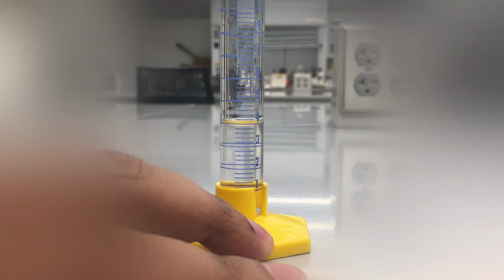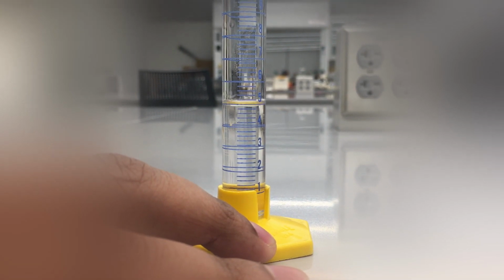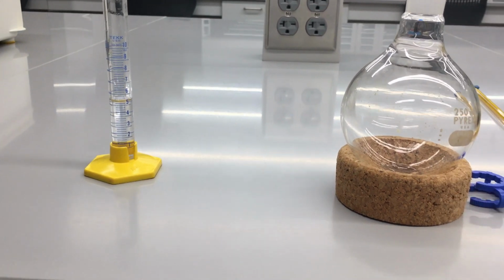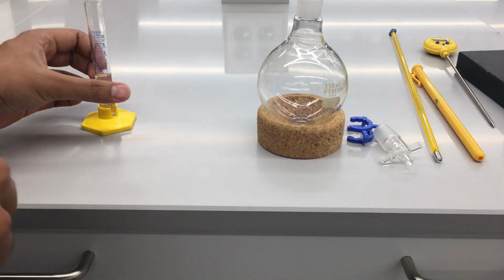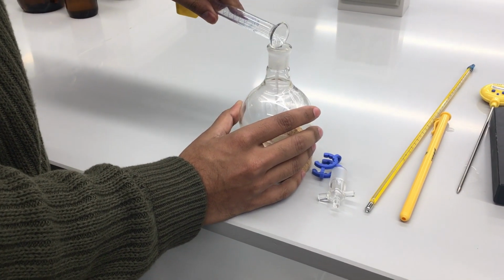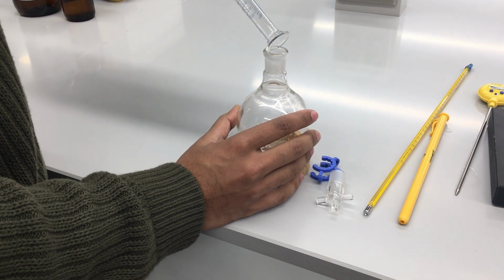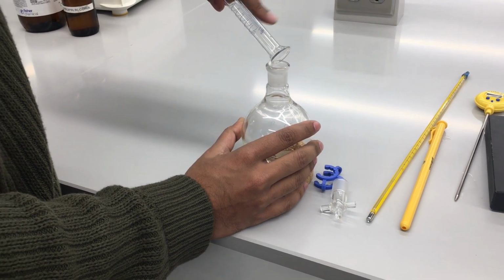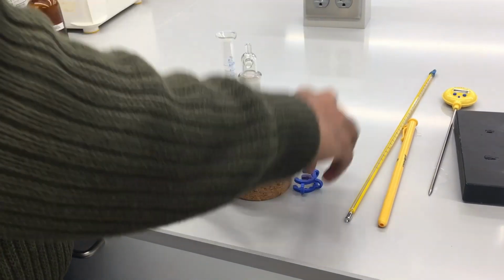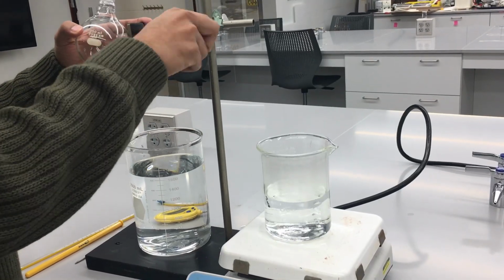So I'll take off the clamp, remove the stopper. You can go ahead and measure out another 5 milliliters of our volatile compound. And this is of course the same thing, but just for trial 2. All right, so 5 milliliters.